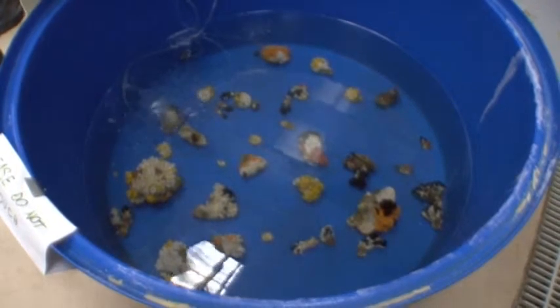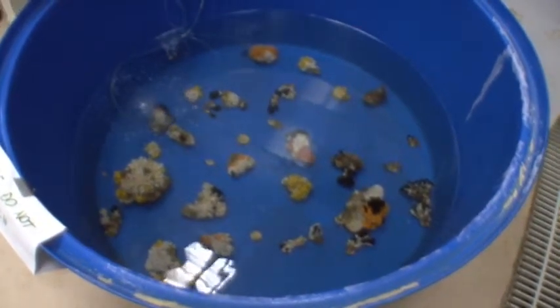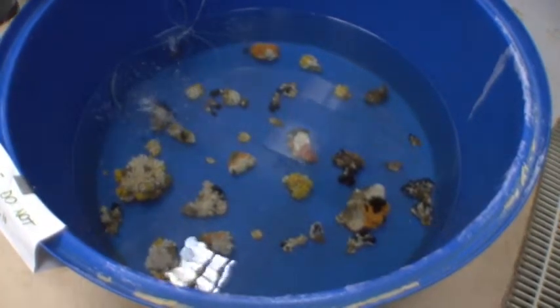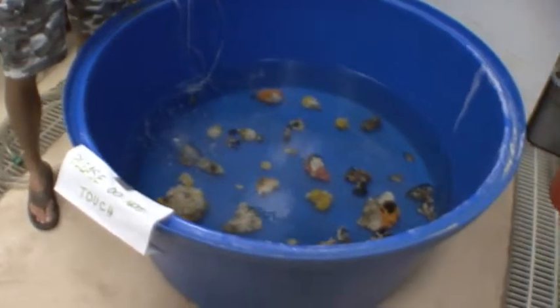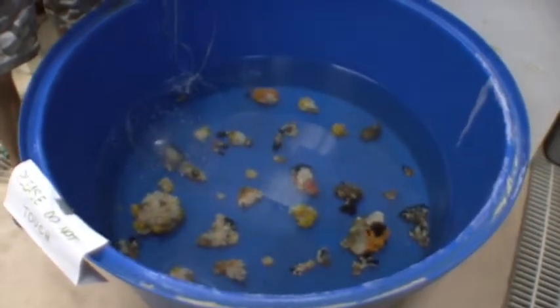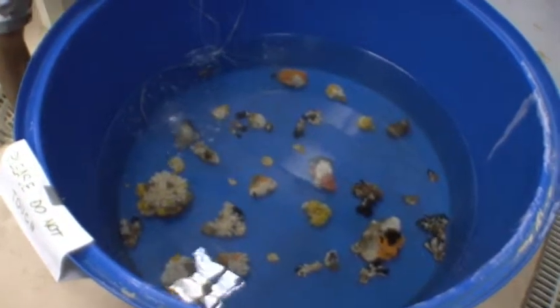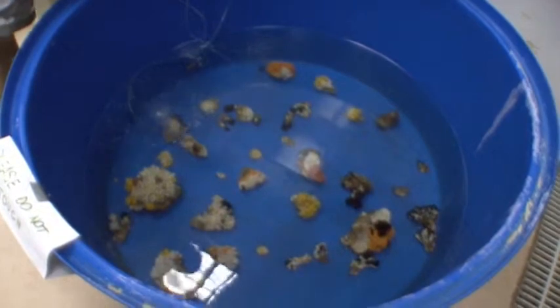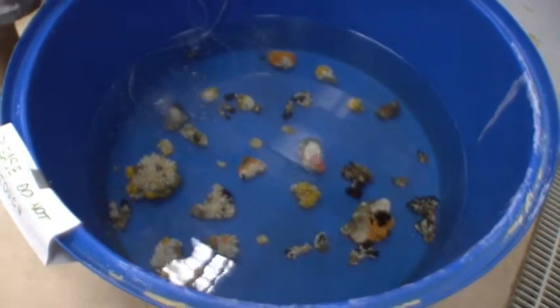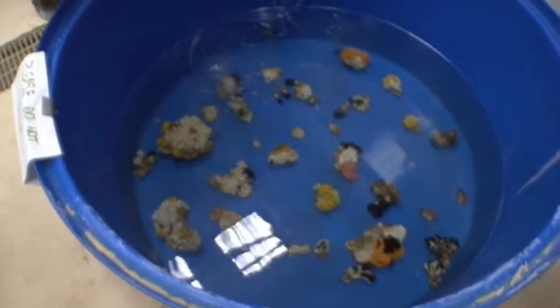We're here at our marine laboratory in Cocodrie, Louisiana on August 8, 2011, looking at our coral experiments from where we've harvested these corals from the platforms in the Gulf of Mexico. And these corals here represent the best of the bunch that we harvested in June, and basically the only ones that we were able to keep alive afterwards. But you see they're in clear water now, and they were able to depurate whatever was in their system out.